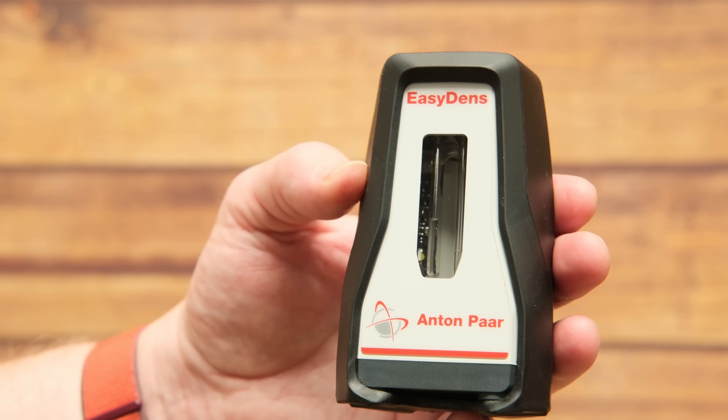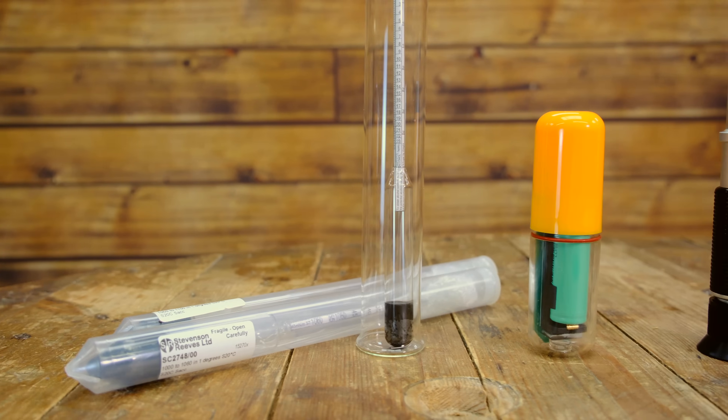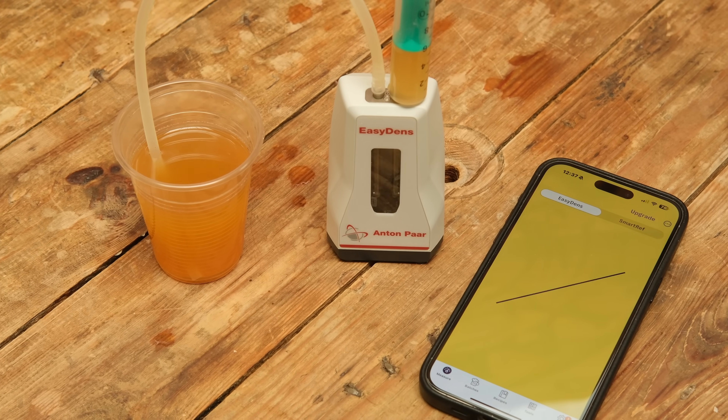Let's jump now into the two devices we're going to be talking about today — one which is EasyDens, which Martin's got there, and this one here which is the SmartRef. Let's start by taking a closer look at EasyDens. If you're an avid watcher of our videos you'll have seen that I've used this in some of our brewing projects. We also did a hydrometer comparison video where we lined up all the different hydrometer options available. So Martin, what is EasyDens? In simple terms, it is an electronic hydrometer — it's going to take readings of the sugar content of the liquids you push through there using sound waves, measuring the density.